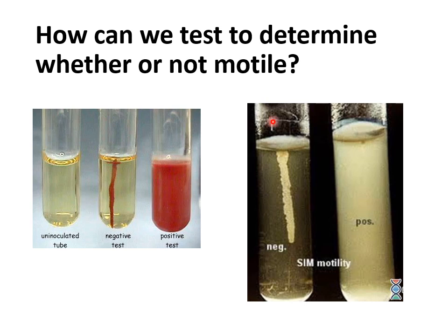If, however, suddenly the whole tube turned red in that case, or in this case, the whole tube becomes cloudy, you can't see a single line. Instead, the whole tube became cloudy. Why did it become cloudy? That bacteria is motile. It moved away from the single line. And if it moves away from these single lines, the whole tube ends up having growth.